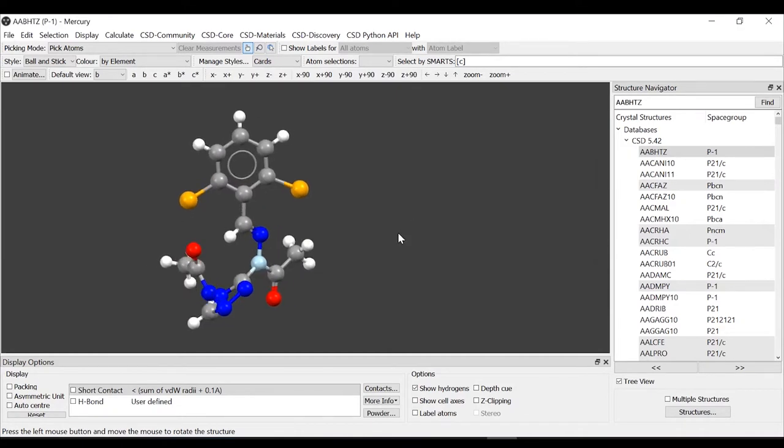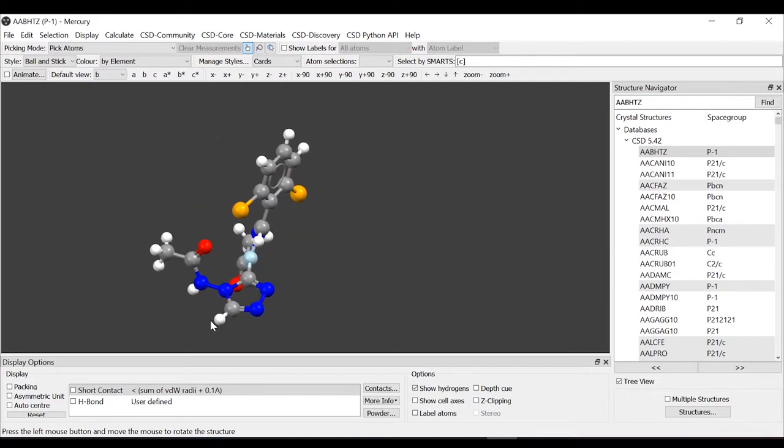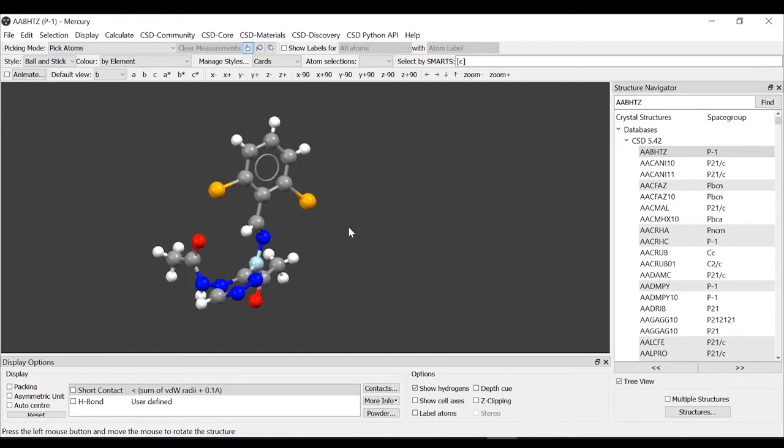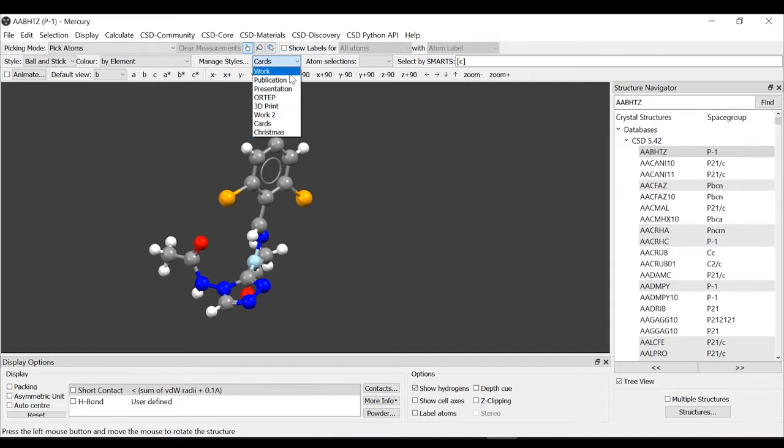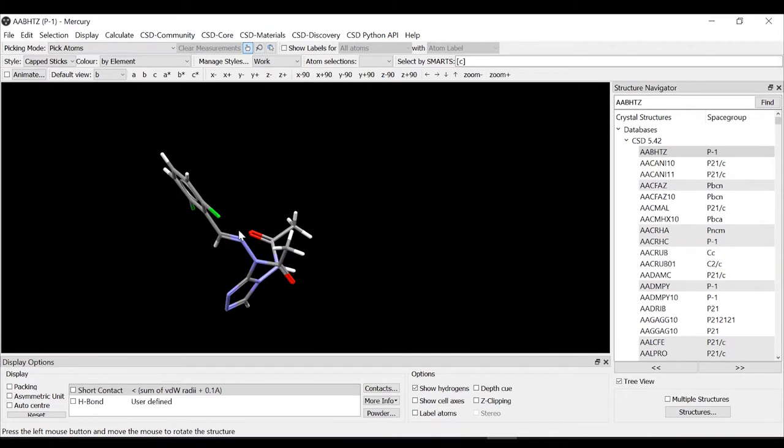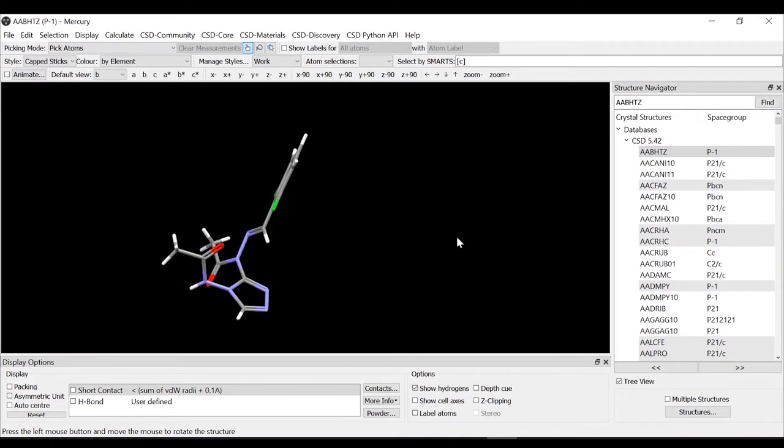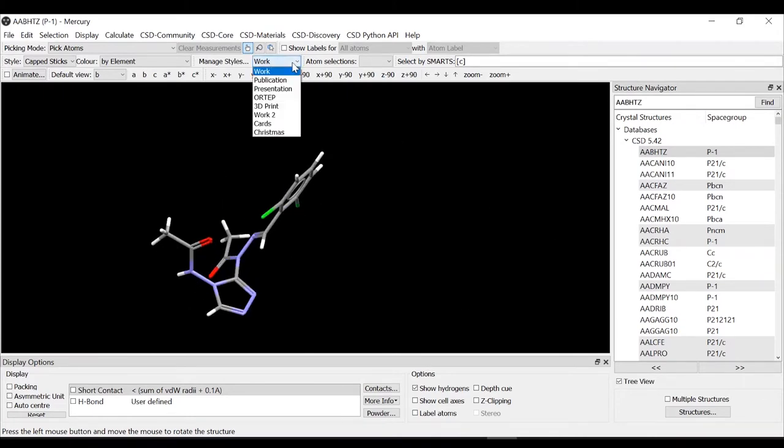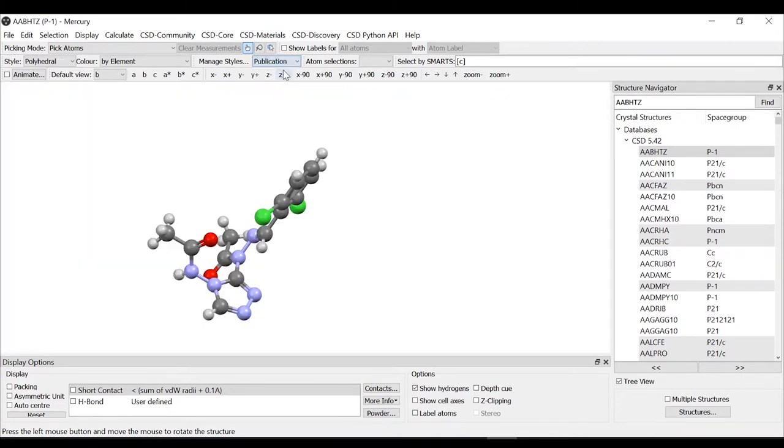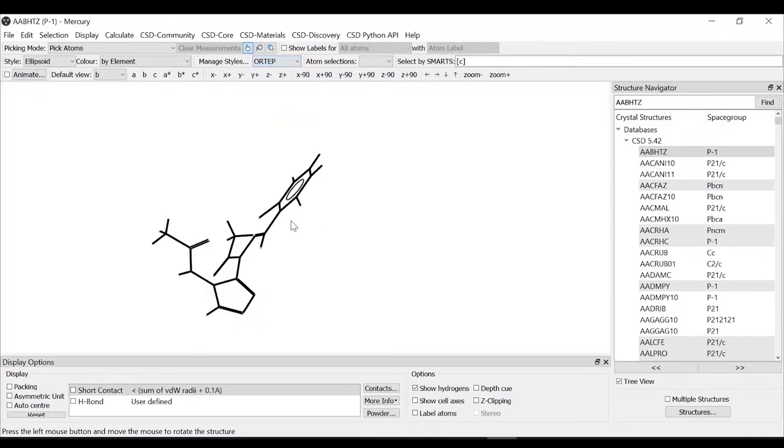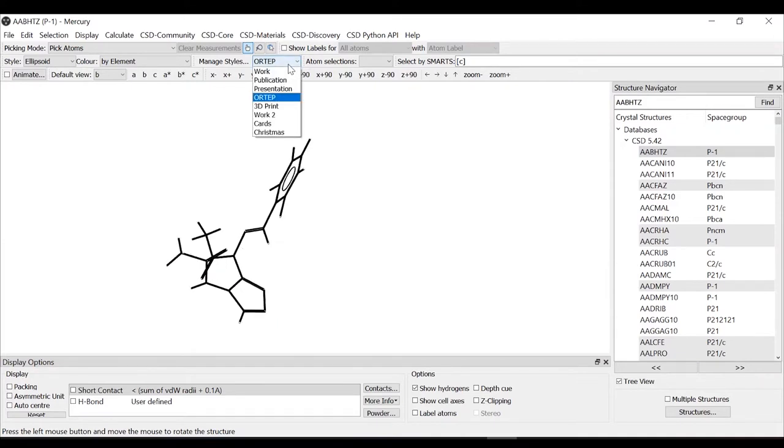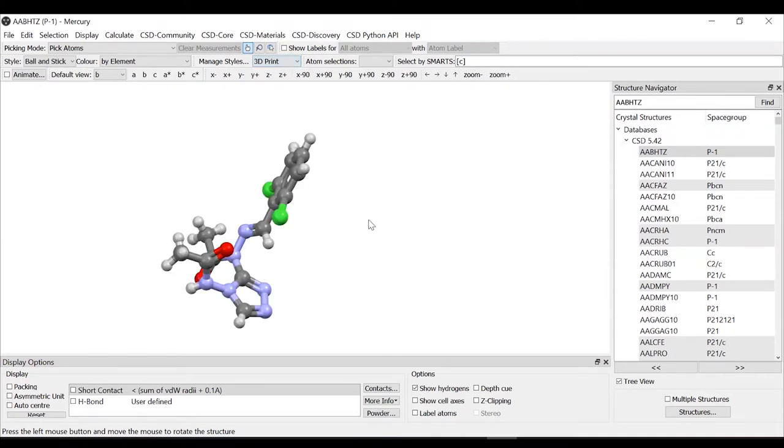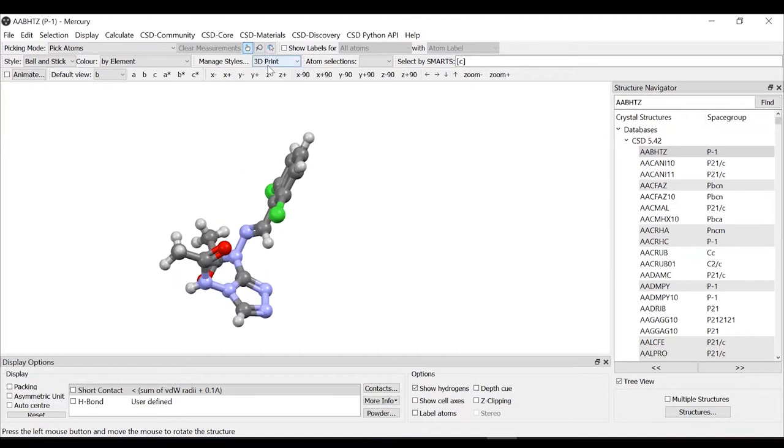You probably have noticed that the colors that I'm using for the background, for the nitrogens, the sizes is different from the default. This is because I have created a personalized style. As you can see from managed style, there are a series of combination of styles, colors, background colors that are predefined. For example, work, publication, presentation. This is not the right molecule to show this style and we have 3D prints.